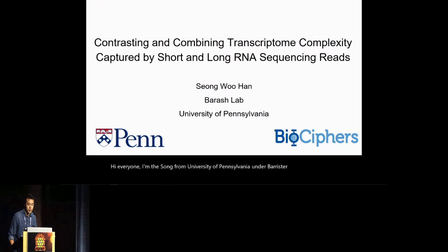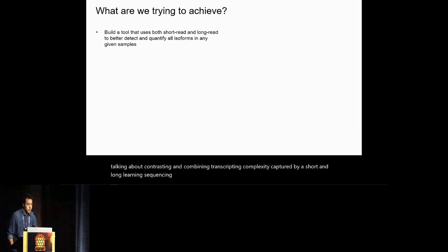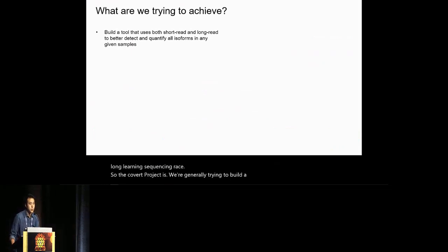Today I'll be talking about contrasting and combining transcriptome complexity captured by short and long RNA sequencing reads. So the goal of our project is we're generally trying to build a tool that uses both short and long reads to detect and quantify isoform in any given samples.